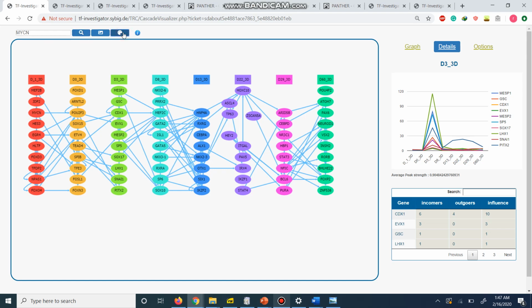Again, you can always repaint. This functionality will allow you to download an image with a high quality. However, this functionality is mostly available in Mozilla Firefox for now. We hope in the next version we'll be able to provide it in all browsers.